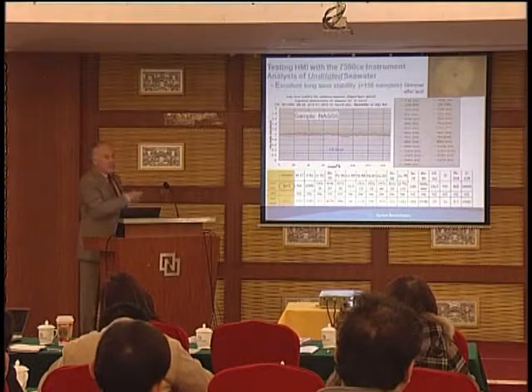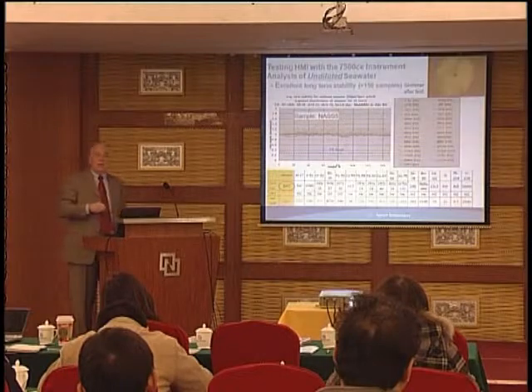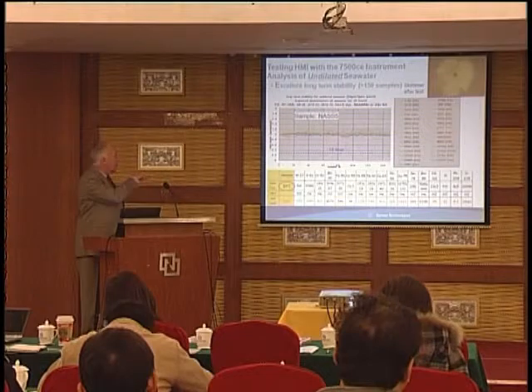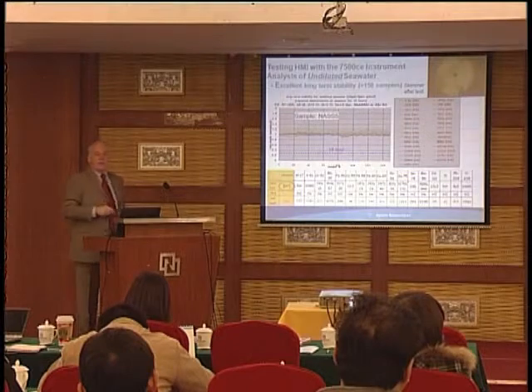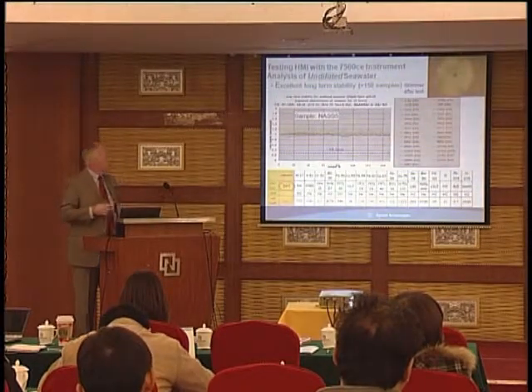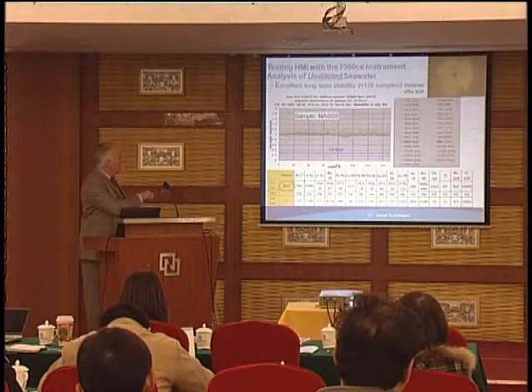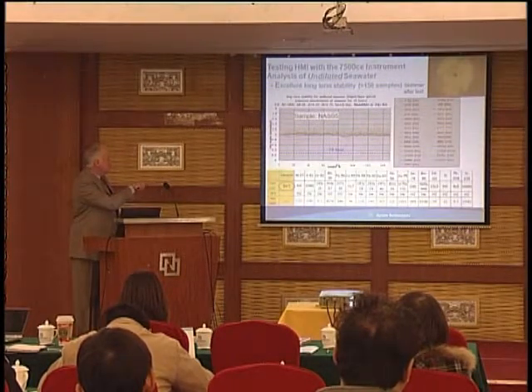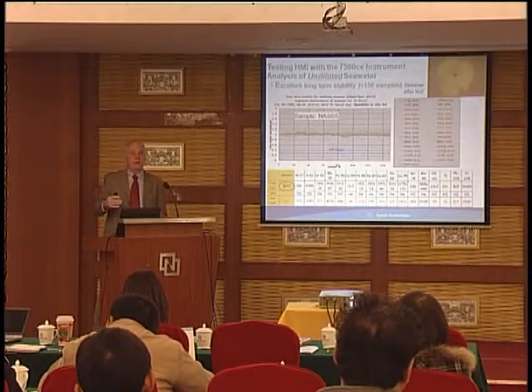And so this is a 7500 CE instrument, last generation instrument. This is 15 hours of continuous analysis of NAS5, which is a seawater reference material. You can look at the stability for this range of elements from beryllium to uranium. So 15-hour analysis, undiluted seawater, using the technology that I've just shown you. So we've come a long ways on solving that matrix tolerance problem as well. And yet you can see down here, I'll just point to a couple. These are the certified concentrations for the NAS5. These are the measured concentrations, and in most cases we were very, very close to that.